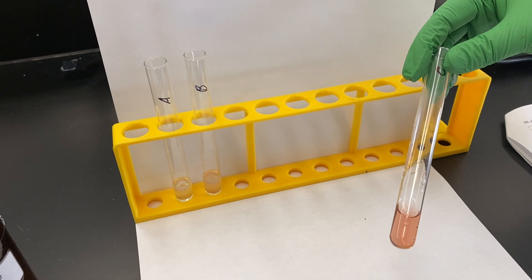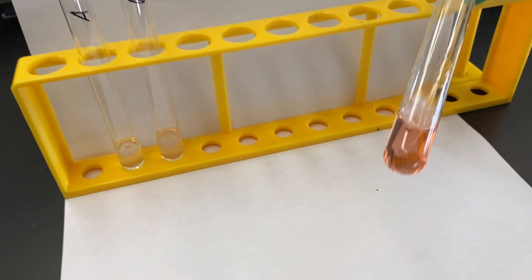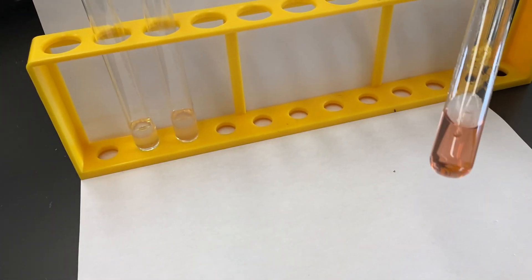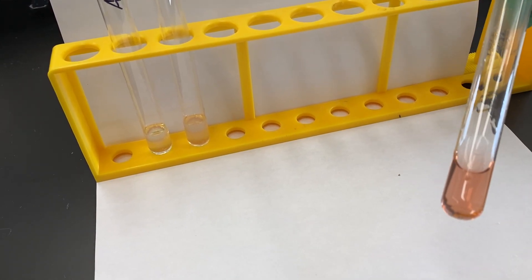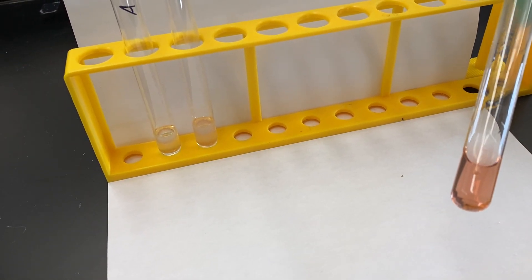We'll look at all four test tubes in just a second. This is pH 7 with distilled water. Throw it on your data sheet.